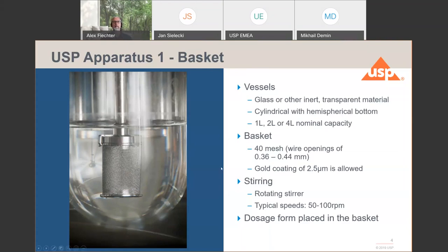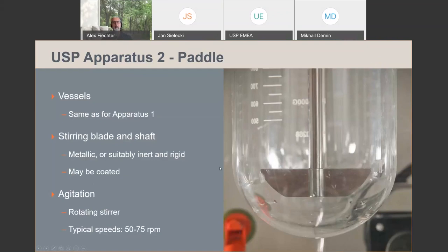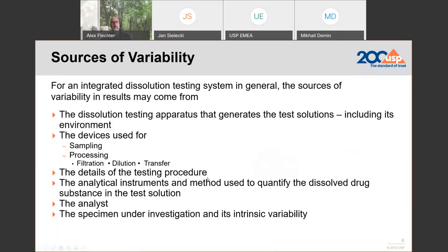For the paddle assembly, we use the same glass vessel but instead of a basket we use a paddle attached to a shaft. The same inert material is used; we also allow coating with PTFE (Teflon), or there are even shafts and paddles available made entirely of PTFE material. Agitation with apparatus two, as seen in monographs, is typically around 50 to 75 RPM.